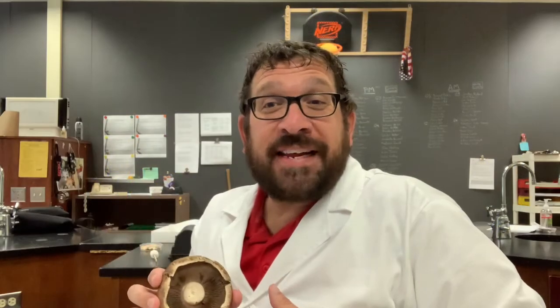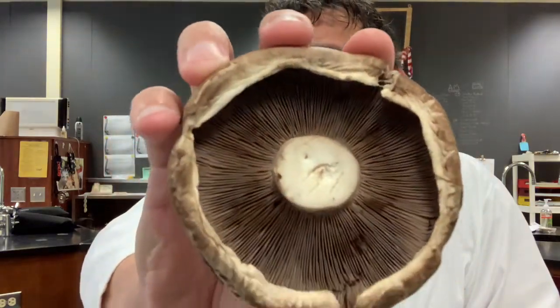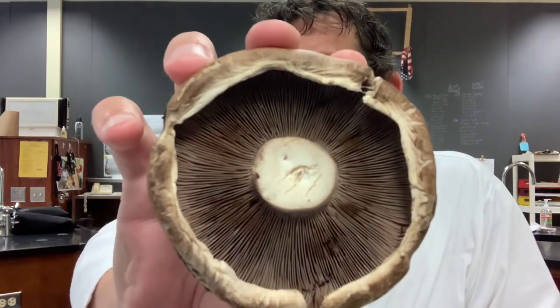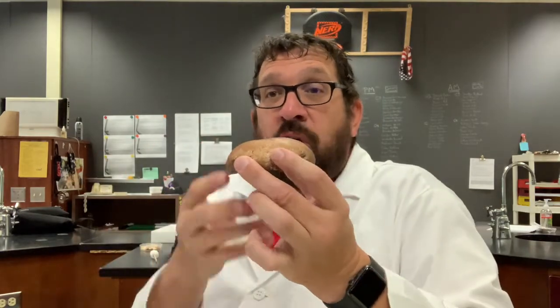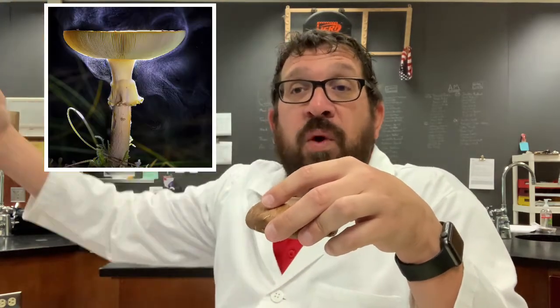The next part I want to get to are the gills. Inside are these folded type of organ, and those gills contain all the spores that are inside of this mushroom. Those spores are what will help the mushroom reproduce. When it gets rid of those spores, it spreads them out around the area where the mushroom is growing, and hopefully some of those other mushrooms take root. Also, those spores are extremely light. So if it's windy enough, those spores, when they fall, will get caught on the wind and go.